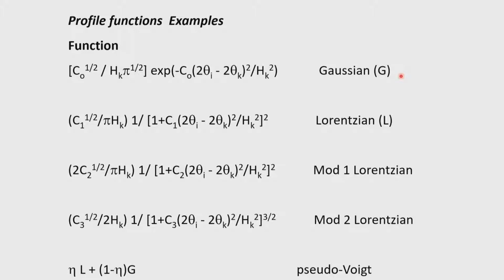So, it is recommended that when we have accessibility to a neutron source, powder diffraction data of a neutron is very, very useful. In fact, a powder diffraction data can also help us in finding, once we solve the structure, the hydrogen atom positions.